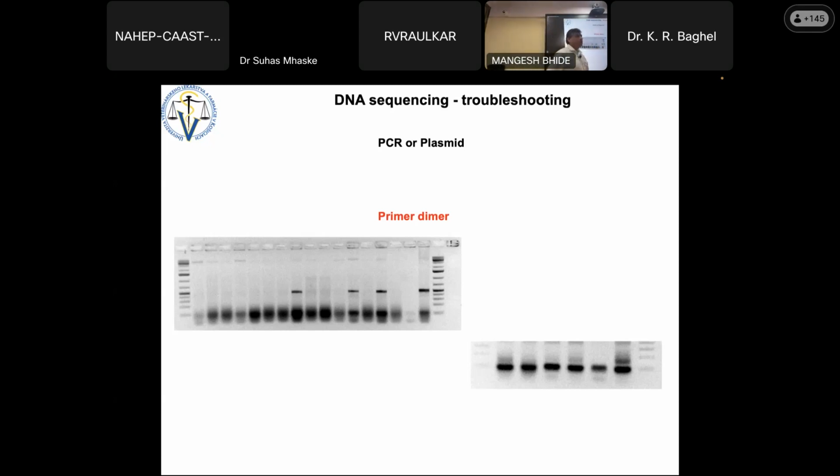Some people are lazy; they don't want to go for gel electrophoresis, and they say, send the PCR product directly to the company. Never send your PCR product without purification. The first rule is always purify your PCR product from the gel.